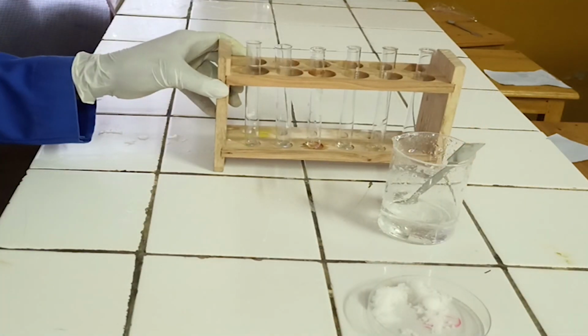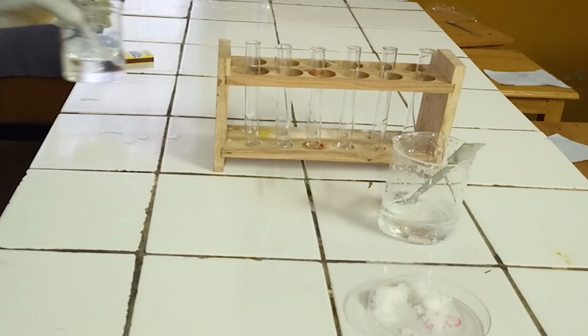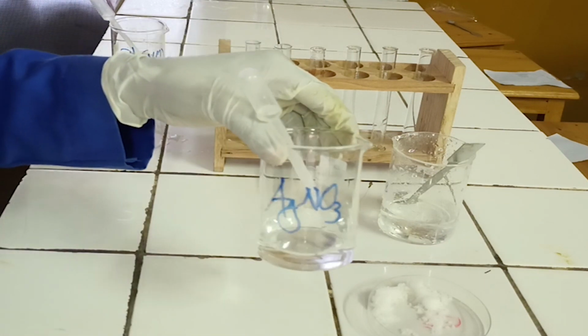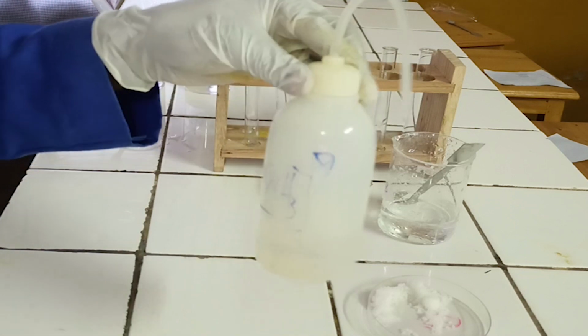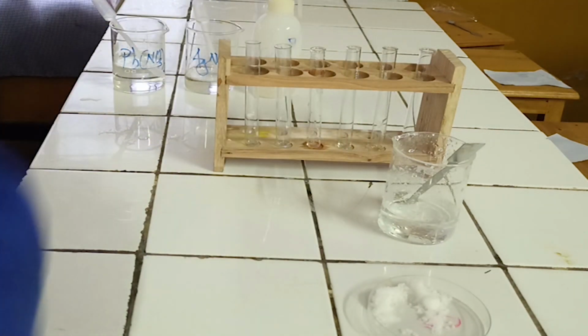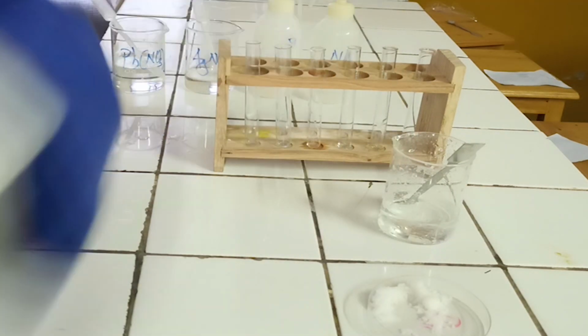Chemicals required. 1. Lead nitrate solution. 2. Silver nitrate solution. 3. Concentrated ammonia. 4. Diluted ammonia solution. 5. Diluted nitric acid.